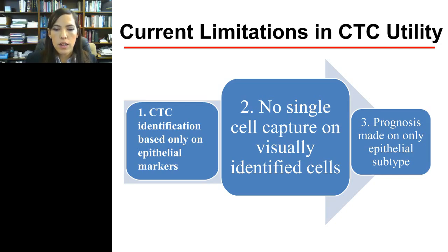So this method allows cell trapping in individual dielectrophoretic cages. Dielectrophoresis is the process by which a neutral particle, such as a cell, can experience a net force of movement when it's exposed to a non-uniform electric gradient. And here's a schematic of this individual dielectrophoretic cage and one cell that's housed in it. So we can control the movement of these cages, which in turn allows us to isolate these single cells.